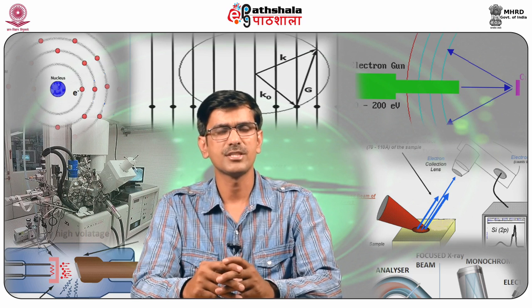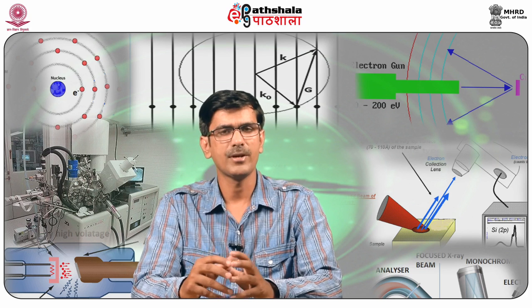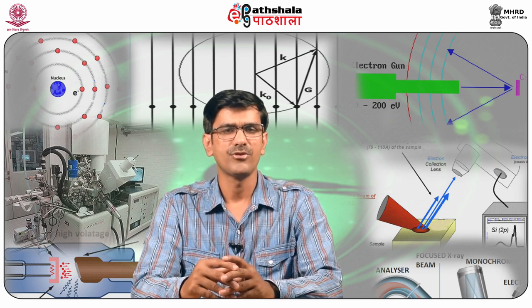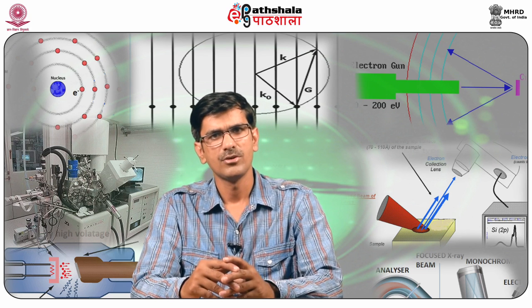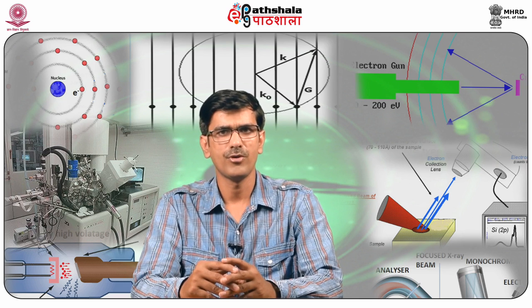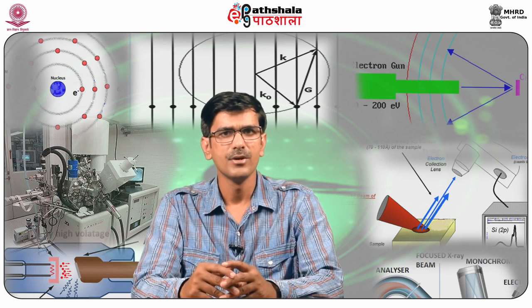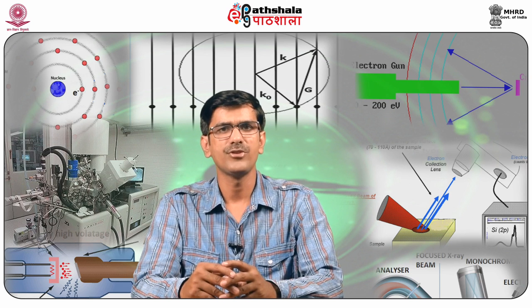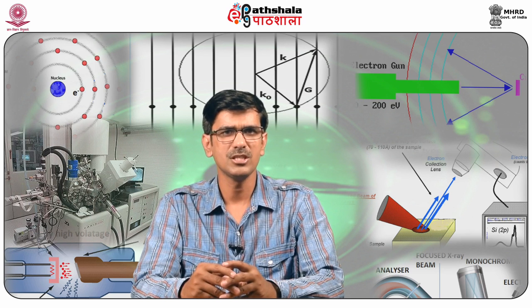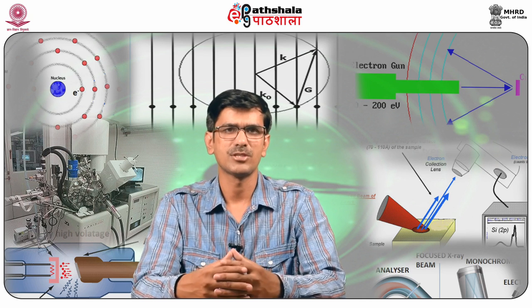The diffraction pattern of the synthesized carbon aerogel polyaniline nanocomposite shows 5 typical peaks at 8.7, 14.9, 20.5, 25.3, 27.1, corresponding to the 001, 010, 011, 020, 200 planes of the polyaniline. Peaks at 20.5 and 25.3 are attributed to periodicity parallel and perpendicular to the polyaniline polymeric chains respectively.